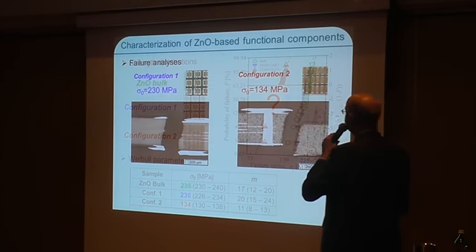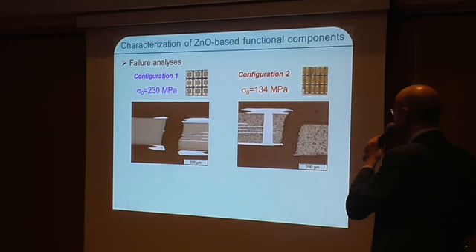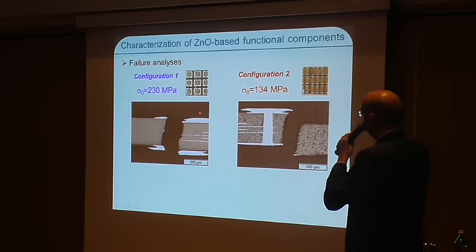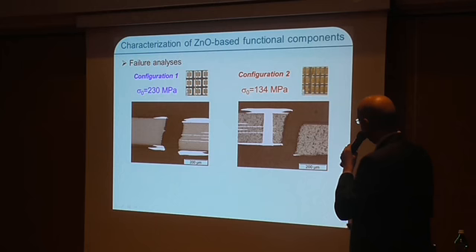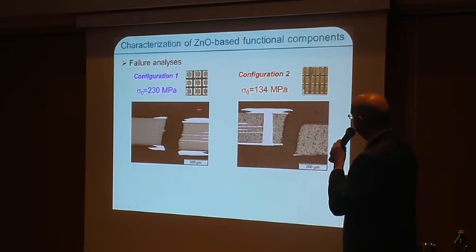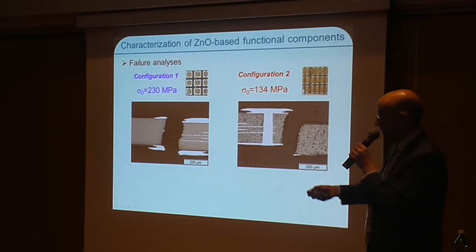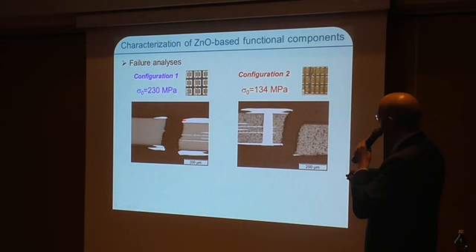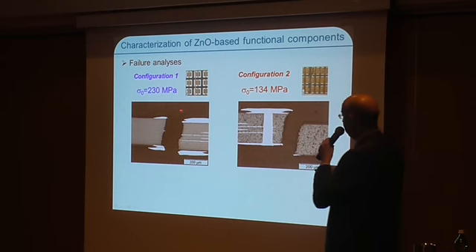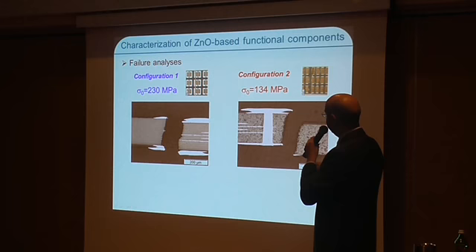The reason is why. So we wanted to understand, and we did some failure analysis. This was the first thing we did. We made some cross-sectioning on broken specimens. And you could see both specimens had the top side under tension, so you have to look at this particular location here. And you could see that in one case, the crack starting somewhere at the surface was going and eventually penetrating the metallization here.